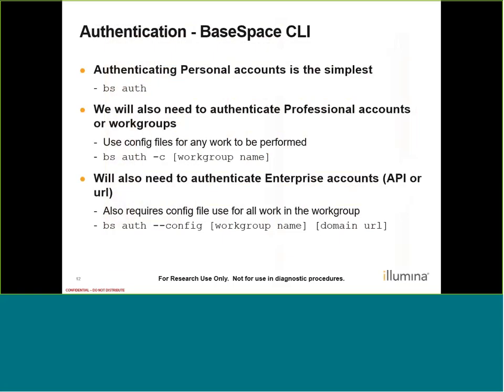Now that we've downloaded our scripts and they're available for use, the next step is actually authenticating our BaseSpace accounts. As some of you may be familiar, we have different levels of accounts available: personal, professional, and enterprise. Authenticating your personal account is the easiest — you just use the BS auth command. Once we start authenticating our professional accounts or our workgroups, we're going to have to create config files in order to properly designate which workgroup we're actually going to be using. For this, I would use the command BS auth -C and then the workgroup name.